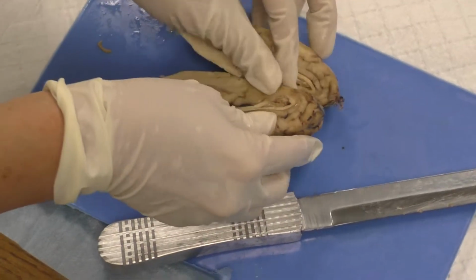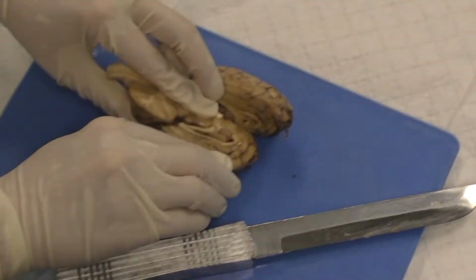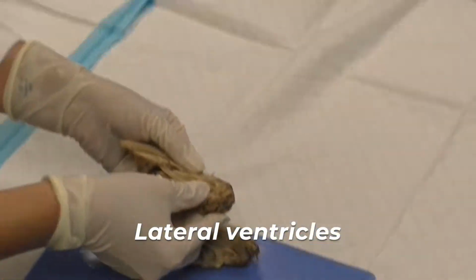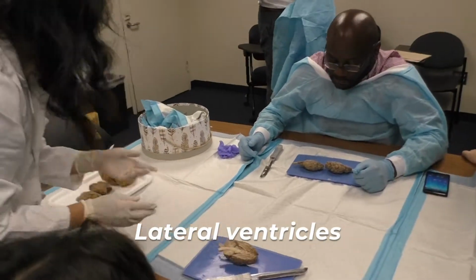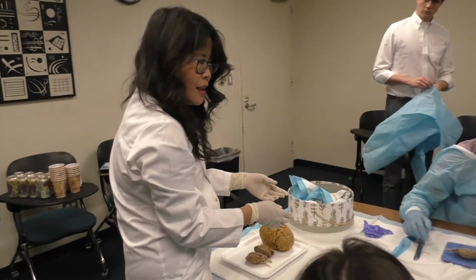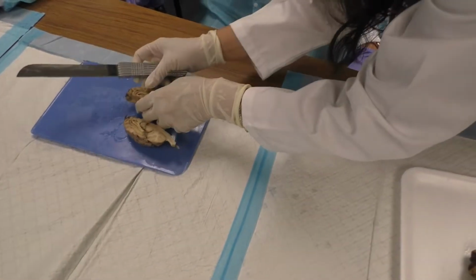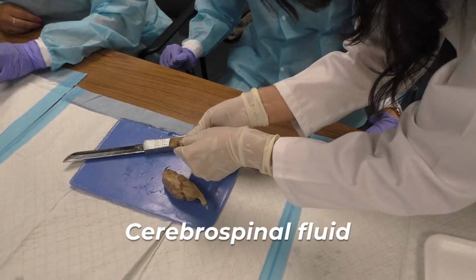Now, let's open this up. Look at that hole. You see that hole? There's a huge space in there. What do you think that space is? The lateral ventricle. I remember when I first learned this, I thought it was kind of cool that there's a fountain in the middle of your brain. What flows inside the lateral ventricles? Cerebral spinal fluid, exactly. So that's the fountain in the middle.